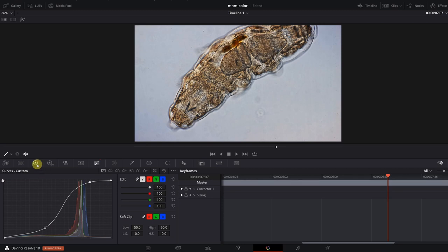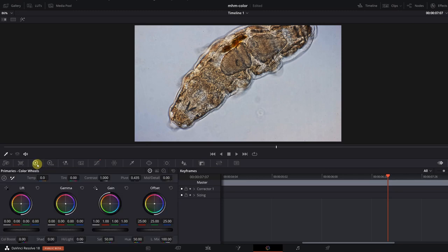I'm switching over now and here I can adjust also the color itself. When I go into the gamma wheel, you can see if I drag it and pull it, I can give everything a bluish tint, and here now a reddish orange tint and greenish. So it's possible for me to adjust the overall color. When I drag it to blue, it kind of gives a little bit of a watery impression here.